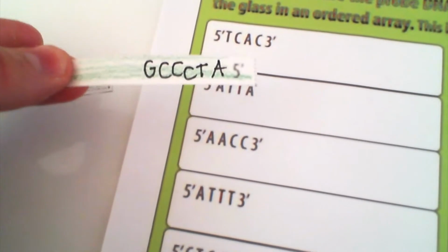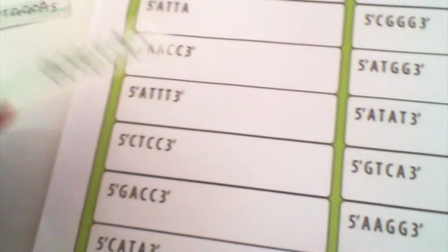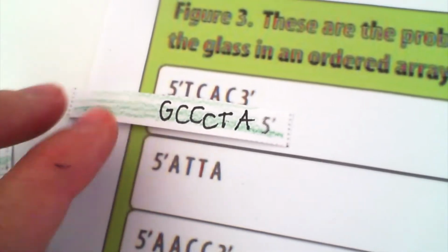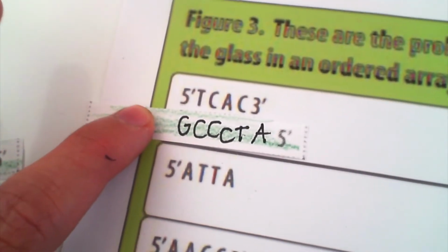So again, normally if we're doing this in real life, we'll just take all the cDNA and then we'll put it on the board and it'll magically stick. But I want to show you the process so it makes sense. So for instance, if I take this first cDNA on here, and I'm trying to see if it matches at all, at least 4 base pairs. My question to you is, would this stick to the board?